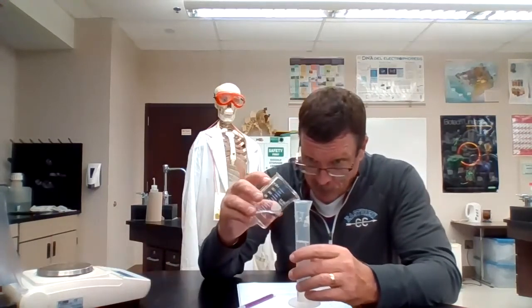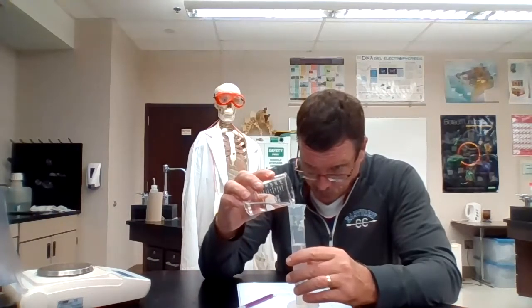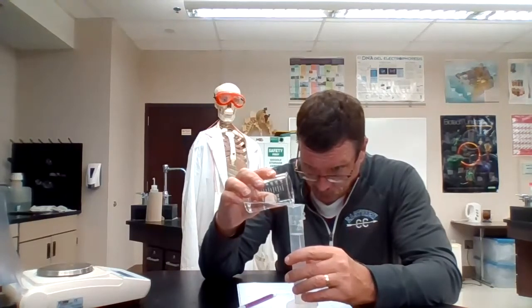And our last measurement is 50 milliliters of ethanol, which has a mass of 60.74 grams. Okay, so now you have that data.